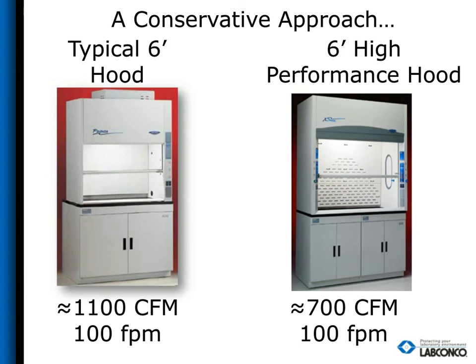If your lab has more than one hood, look at what it could save in energy costs just to lower the CFM. If you have 3 hoods in your lab, you'd be saving about $10,000 per year, and that's on the conservative approach. So you can see it doesn't take a lot to see a return on investment for these hoods, and that is just talking about the exhaust requirements. That doesn't even go into the savings from having a smaller air handling unit because the CFM requirement is less. On the supply side, it really adds up quickly. So if you are designing a new lab or if you want to replace a fume hood, I always recommend to look at high performance if you use your hood on a regular basis.